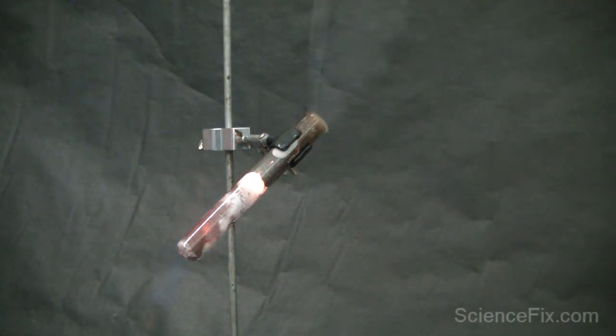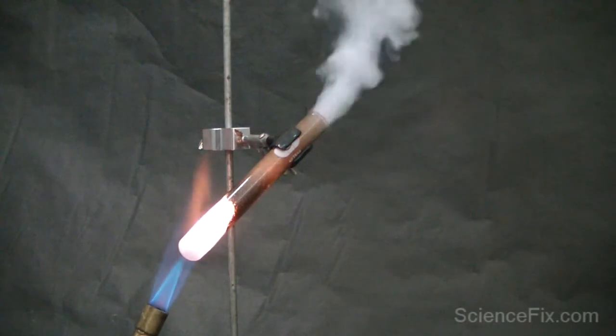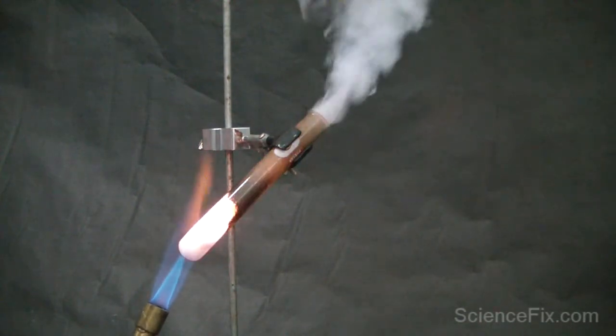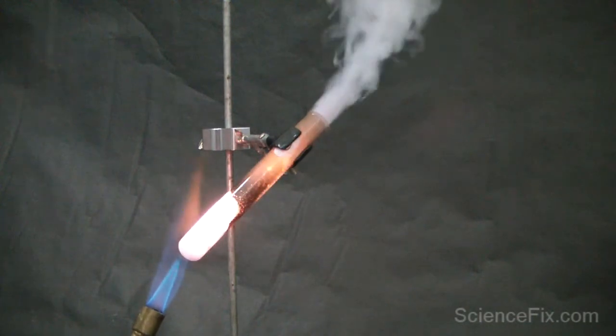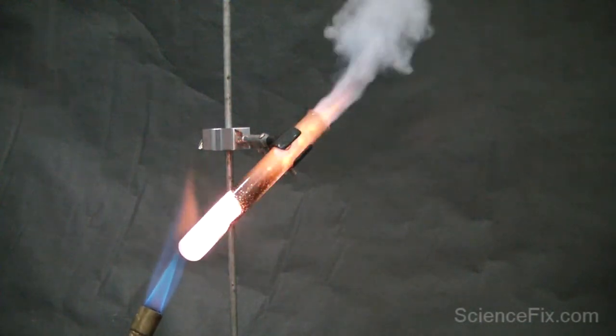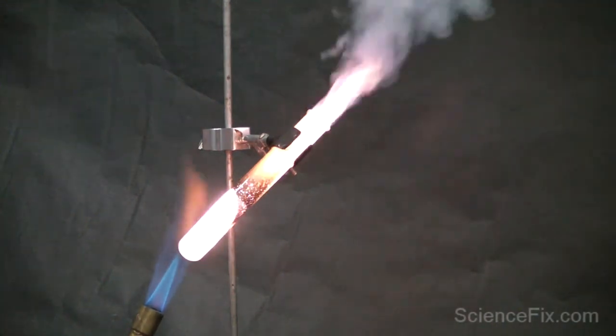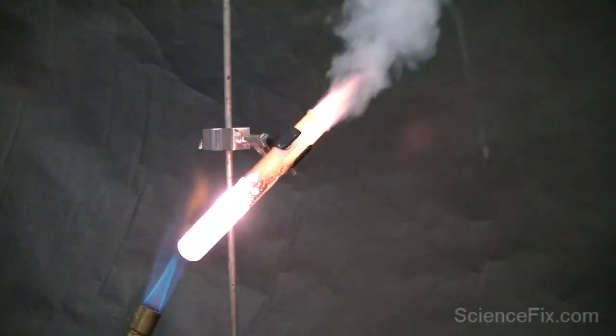The gummy worm contains sucrose, and sucrose has a lot of energy in its bonds. The sucrose reacts with the potassium chlorate. What the potassium chlorate does is release a whole bunch of oxygen to react with that sucrose.